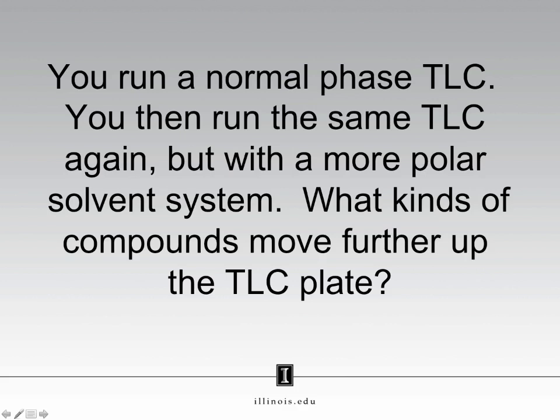Let's break this question into components. There is the stationary phase to consider, and there is the mobile phase to consider. You know that a normal phase TLC plate is a polar stationary phase. That means polar compounds will stick well and move a small distance, whereas nonpolar compounds will not stick well and will move a greater distance. Now let's talk about the mobile phase. By increasing the polarity of the solvent, we'll increase the strength of that eluent because we are using a polar stationary phase. And we know that increasing the strength of the eluent means that all of our compounds move faster.